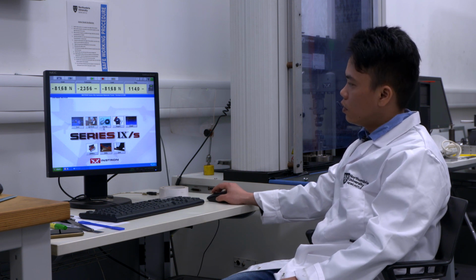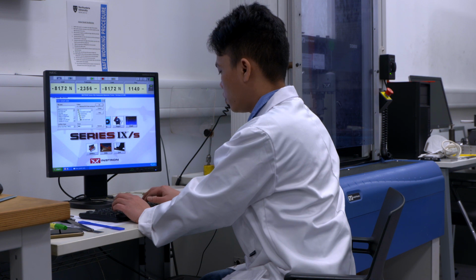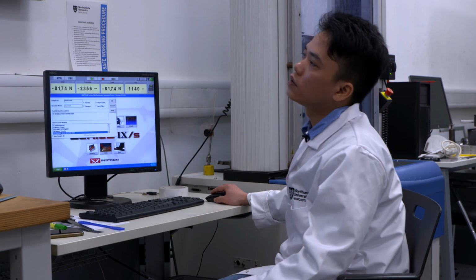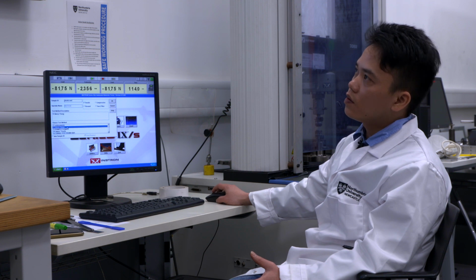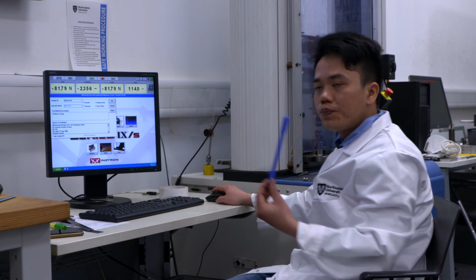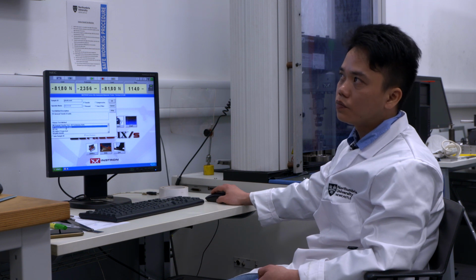To create a new name of the file, name is plastic. Click OK. As said, we need to choose another test method. Okay, in this case, for flat specimen like this one, we need to choose general tensile test using SI units.